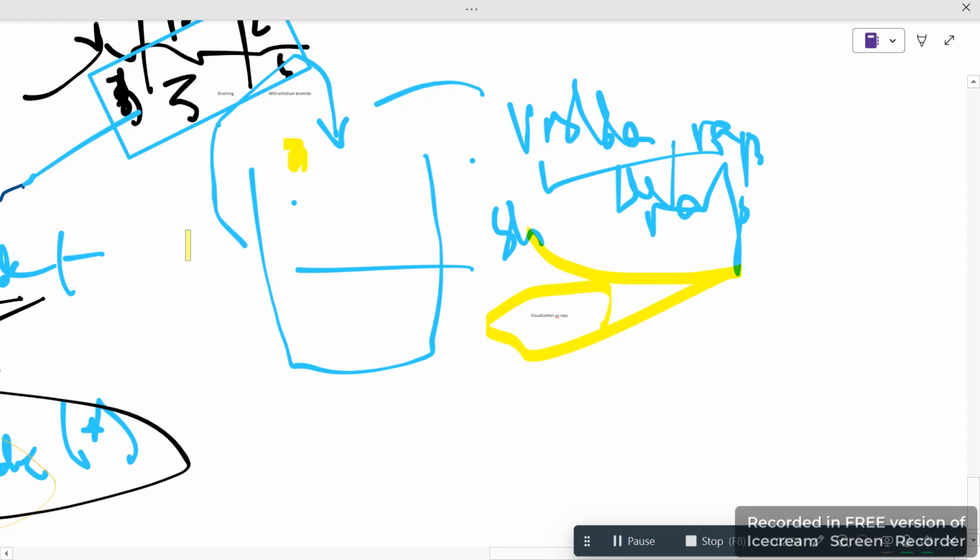So if these are the particles 1, 2, and 4, how far will they run? The smaller they are, the farther they will move. So here you will find some band. In what color would that be? That band would be in orange color. This is a very important point. There might be an MCQ asking which band color would you see when the staining process goes? So that would be orange color.